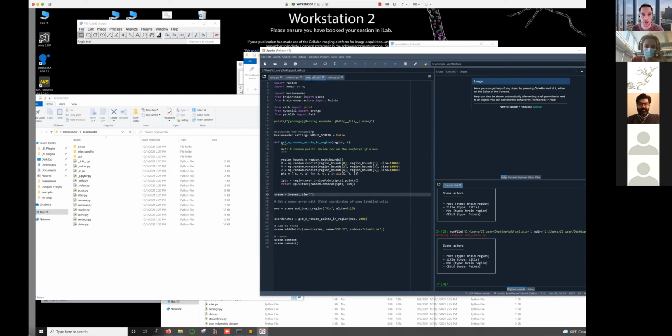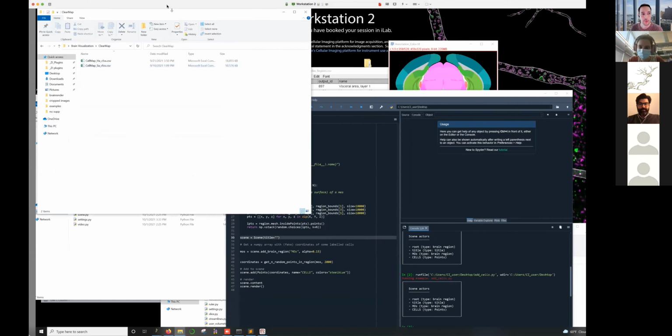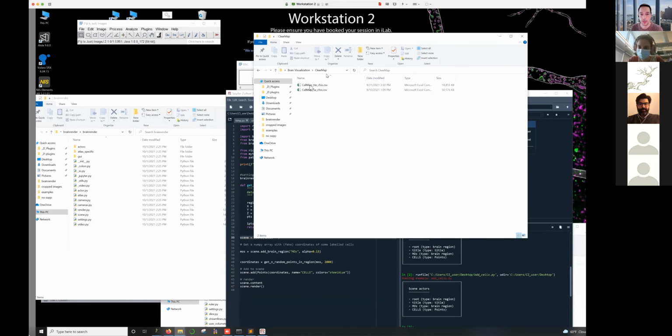as untitled images. Okay, so the first thing, now we've got this working, is we want to actually start to use it with the ClearMap cells. And so hopefully you guys have got those downloaded. They're just some small CSV files that we created from the CellMap pipeline. So there should be a folder here with, this is the haloperidol, and this is the saline. So to start with, I would just use the saline data set.